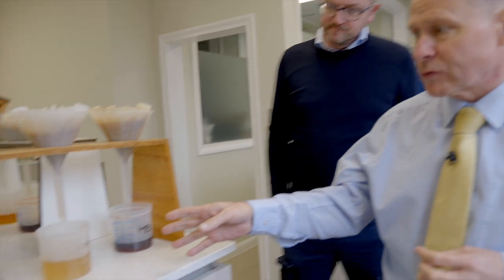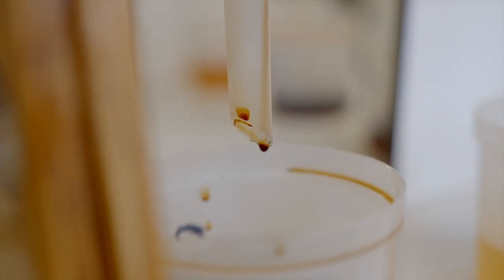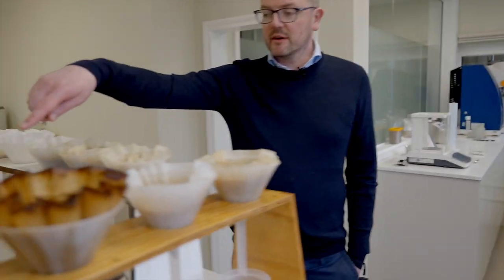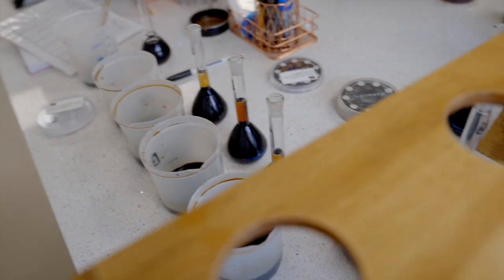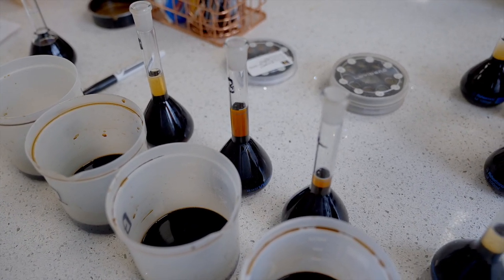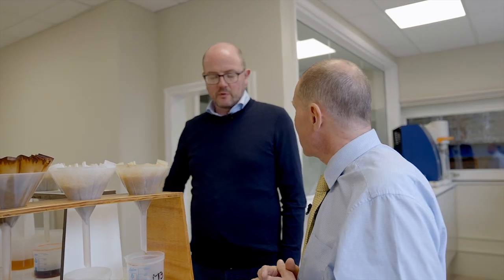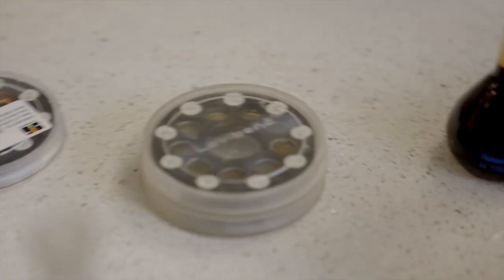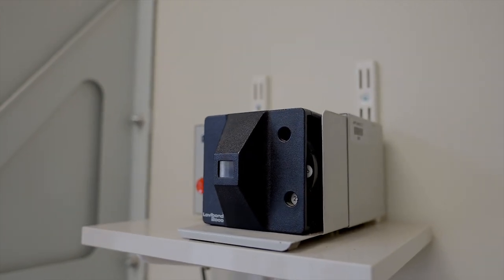So we've got a range of colours here — we've got crystals, a white malt control sample, and patent malts. Those are what we made today or late yesterday, and they're the blacks. You can see here — is this what you were mentioning with the dilution? If you put that into a glass vial and put it into one of these, no light would pass through it, so you have to dilute it down to get the best from it. By Lovibond, is that done by eye? It is — it's a colour comparator. The discs are a certain colour. You can't be colourblind because you can't pick up the subtle colour differences.